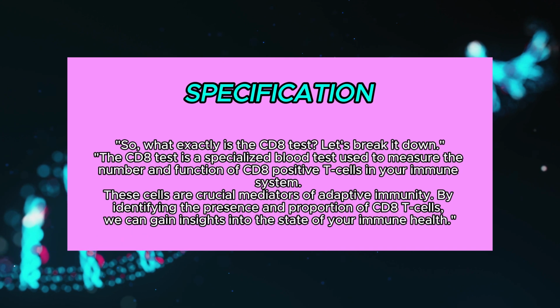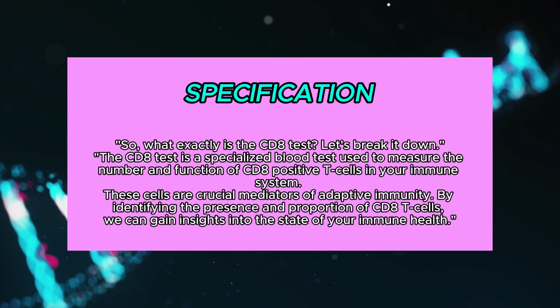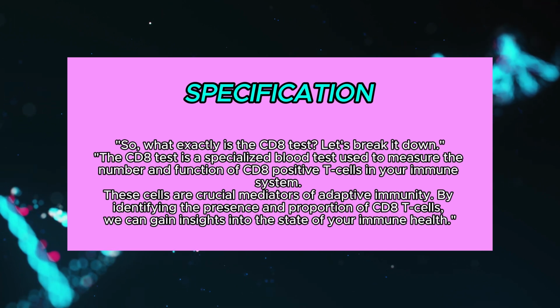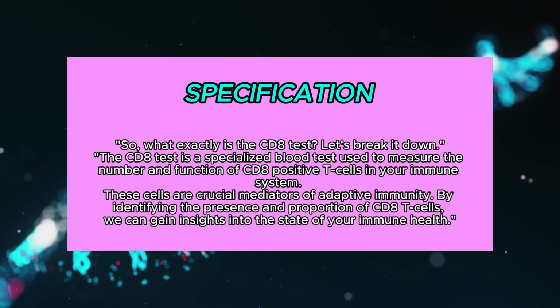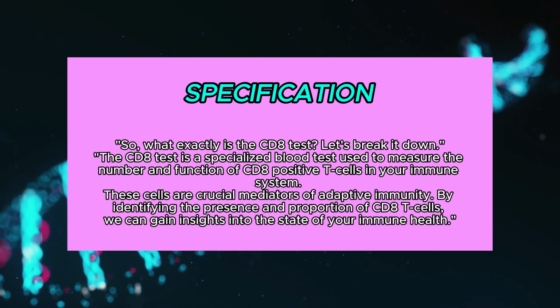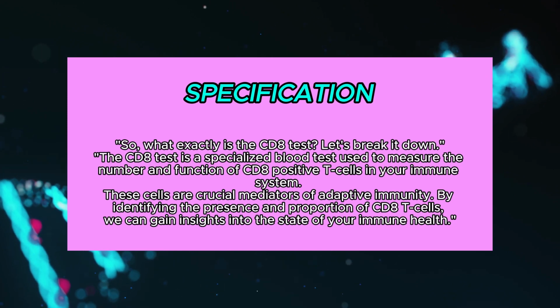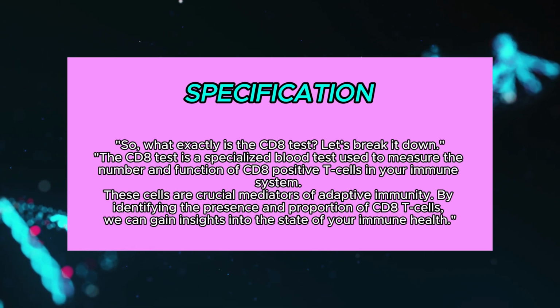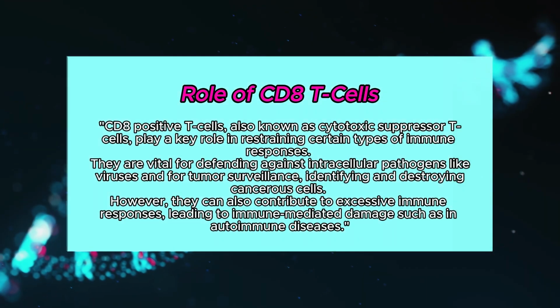Specification of the CD8 test. So, what exactly is the CD8 test? Let's break it down. The CD8 test is a specialized blood test used to measure the number and function of CD8 positive T cells in your immune system. These cells are crucial mediators of adaptive immunity. By identifying the presence and proportion of CD8 T cells, we can gain insights into the state of your immune health.